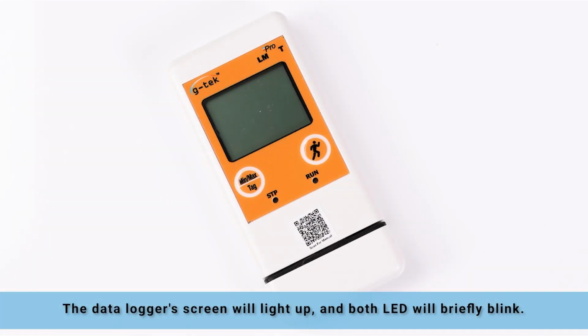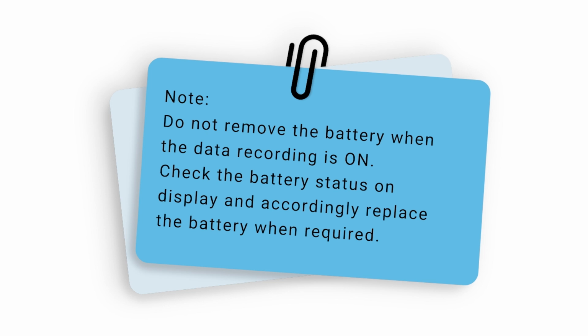The data logger's screen will light up, and both LEDs will briefly blink. Note: do not remove the battery when the data recording is on. Check the battery status on the display and accordingly replace the battery when required.